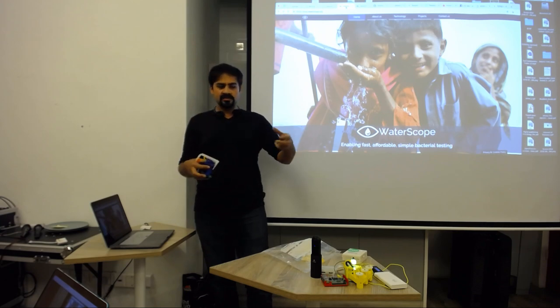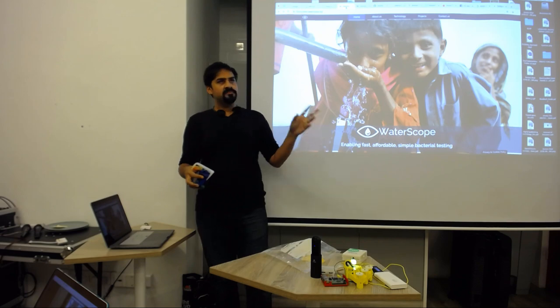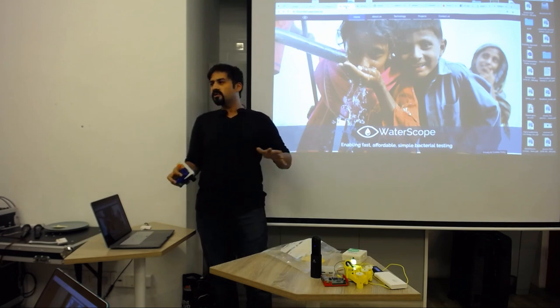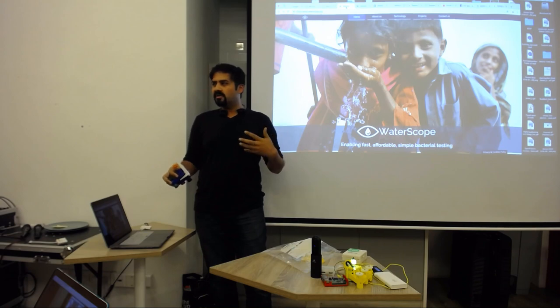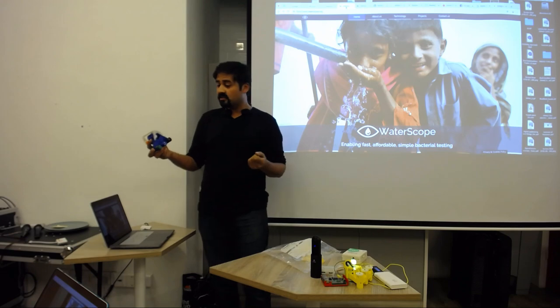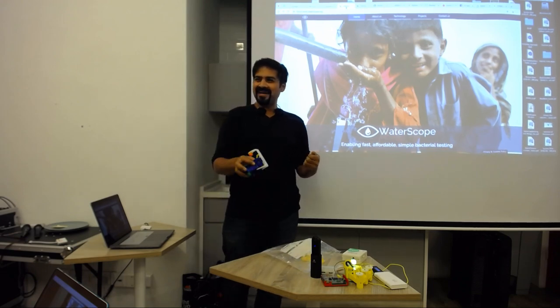And you buy these cartridges, you put a water sample in it, and shove it into a box, and it'll tell you whether the water sample is contaminated or not. And it's designed for places that have just experienced some kind of disaster, and you're not really sure if your water supply is safe to consume. And because it's digital, for the win, you can manufacture it locally.